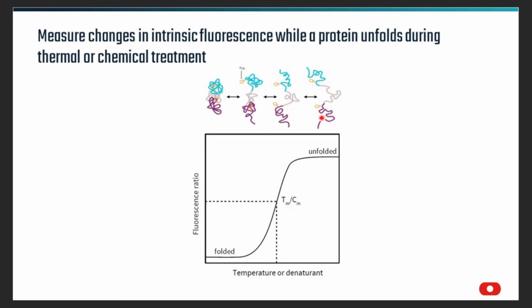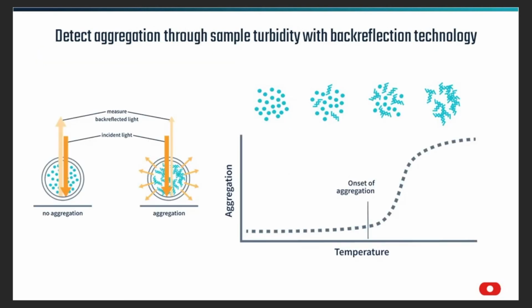Yes. Okay. So as can be seen in the cartoon, as this protein's conformation changes from the folded to the unfolded state, the environment that these aromatic amino acids, the tryptophan and tyrosine, are in, evolves and changes as that protein loses its structure. And this changes that fluorescence profile, as shown in the figure that Jie presented at the beginning of his presentation. And it is this change in that fluorescence profile that is monitored on the Prometheus to help identify and ascertain the conformational stability.